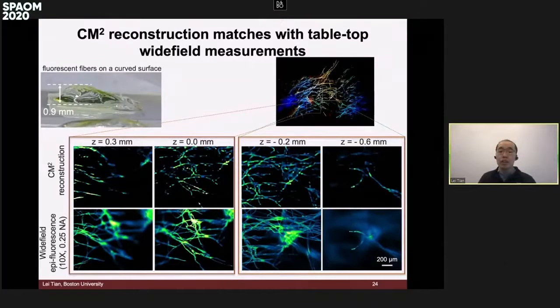Appearing in the measurement. Whereas in our case, because we're performing a 3D deconvolution, we're trying to only recover the features that are in focus, and the algorithm will reject all the out-of-focus information by virtue of this reconstruction process. This is clearly demonstrated by these zoomed-in views. You can see that the in-focus features are matched relatively well to the benchmark, but a lot of these clearly out-of-focus features are rejected by the reconstruction.